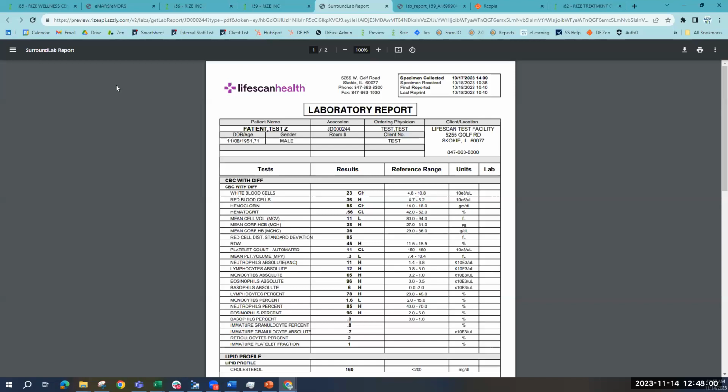Okay. Do we have another one? If the patient is in the office giving a specimen, will the collection date auto-populate? Maria, do you know that one? Or Daniel's going to answer it?